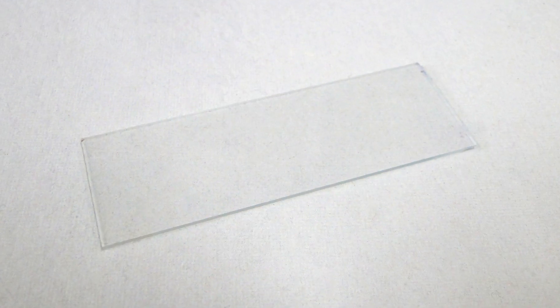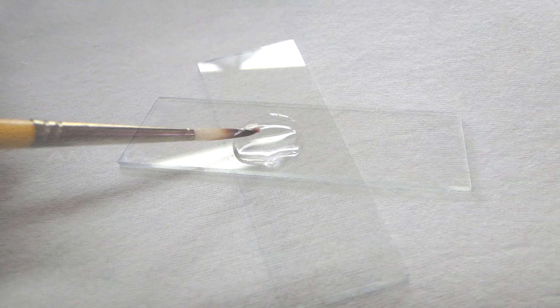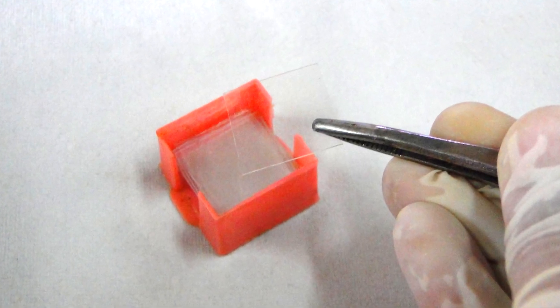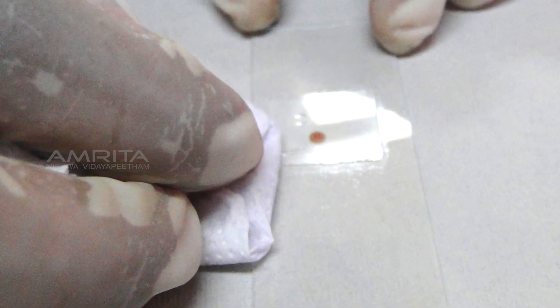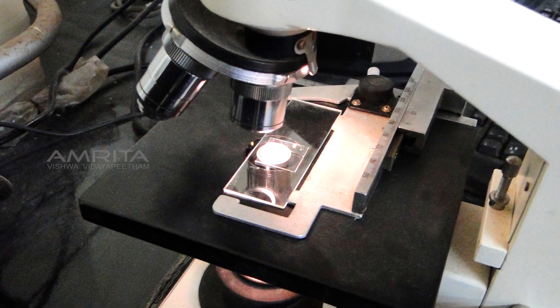Take a clean glass slide and pour a few drops of water onto the slide. Using a wet brush, transfer the sections from the watch glass onto the slide. Place a cover slip over the sections on the slide using forceps. Remove the excess solution from the edges of the cover slip by touching the side with blotting paper, and observe the slide under a microscope.